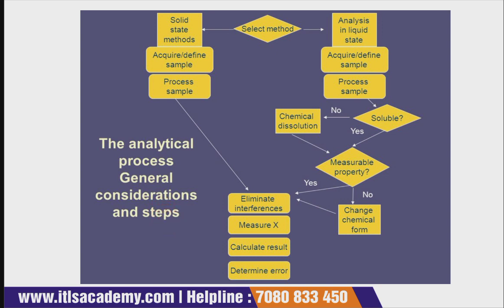So this is how the solid state method takes place. Already I have told you, you have to choose the method to use for the sample. Then you have to choose the method, obtain the percent composition. After that, using the percent composition, you have to calculate the result with the help of any empirical formula or molecular formula, or whichever is relevant for the method.